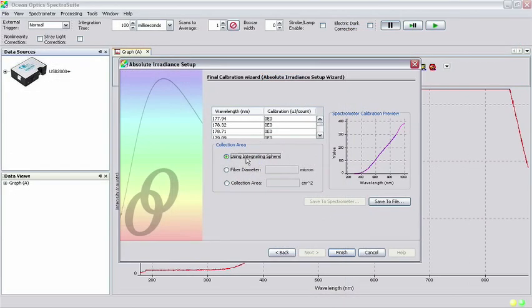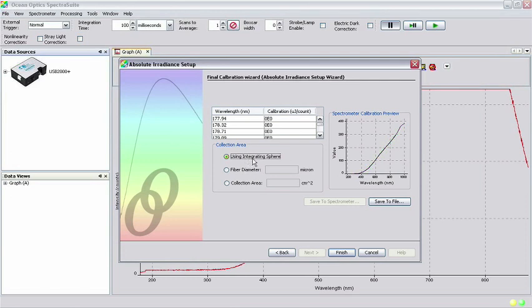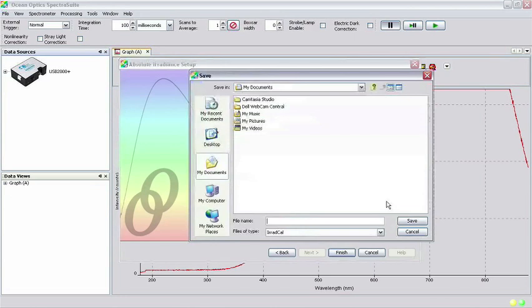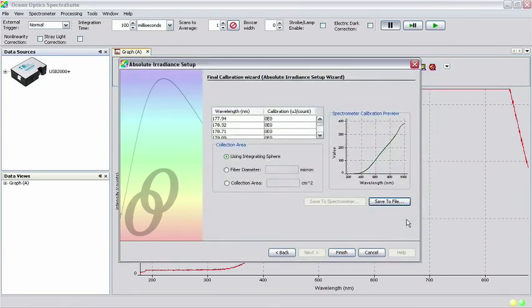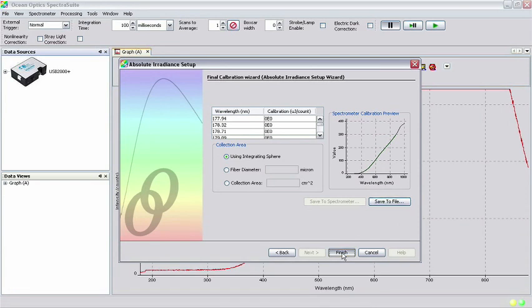SpectraSuite generates a calibration file for your spectrometer at the end of the Absolute Irradiance Wizard. To save this file for future use, click Save to File, give the file a name, and save it to the location of your choice. Clicking Finish brings you back to the main SpectraSuite window.